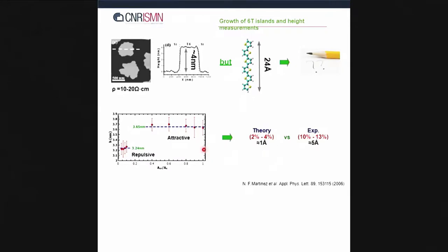This work on scanning probe microscopy also started at a time when we were doing bimodal AFM, which is a technique where the signal of the second mode of the oscillation of the cantilever is overlapped with the resonant frequency of the cantilever. So you are able to increase the phase contrast of the material by using this technique. This technique was developed inside a European project called Force Tool that was guided by Ricardo Garcia. Now it is a technique available on the market.